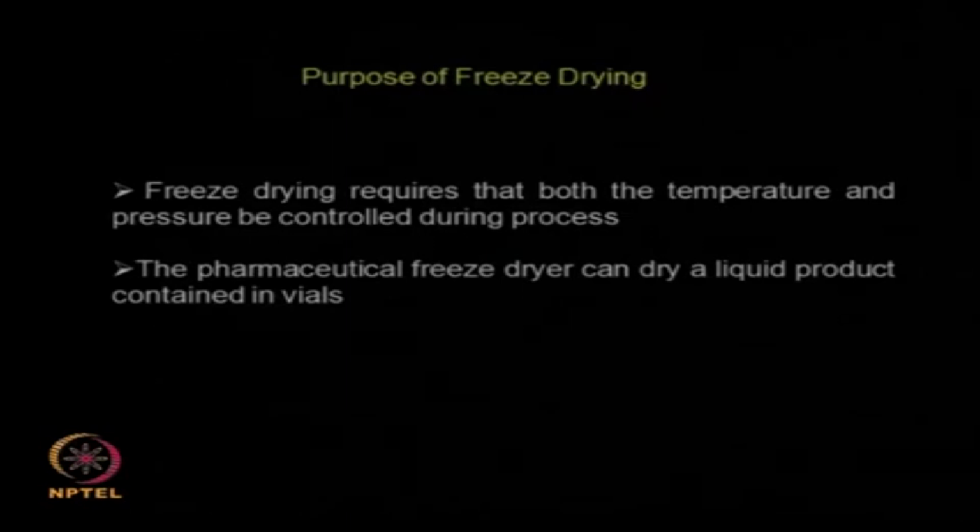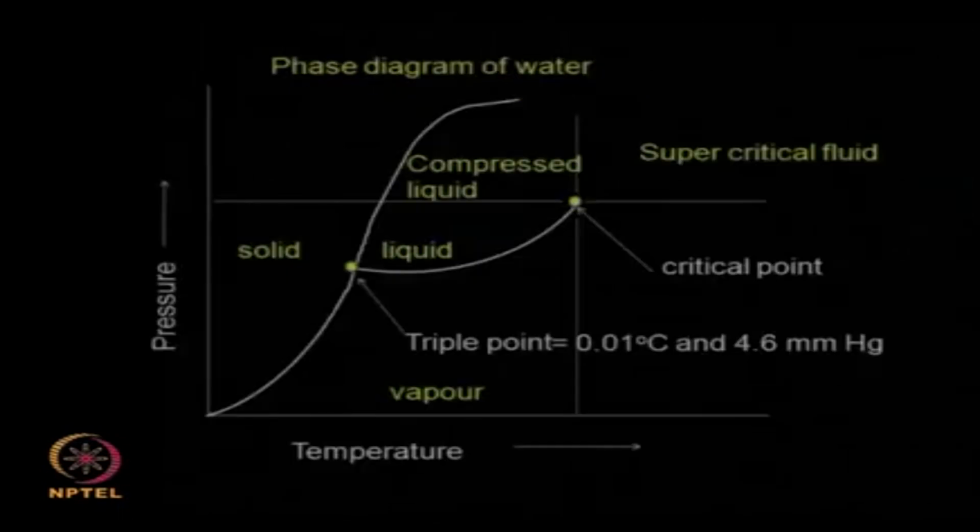So for example, if I have some pharmaceutical product in vials, I can use the freeze drying technique to remove the water or moisture present, at the same time keep the vials in a sterile condition. So that is the advantage of using a freeze drying in pharmaceutical setup.